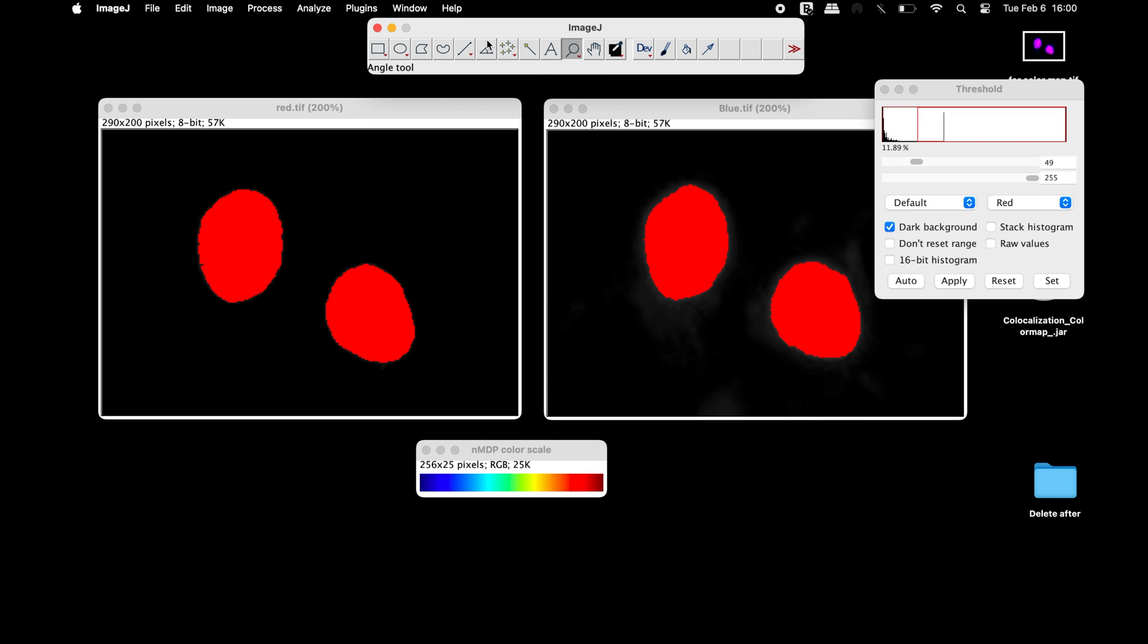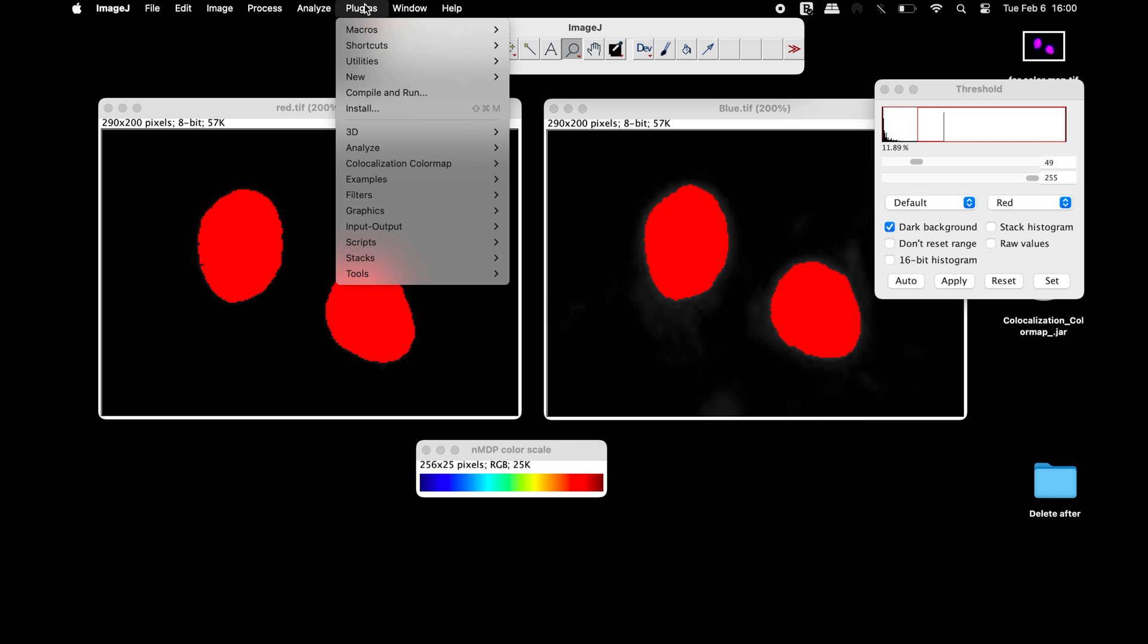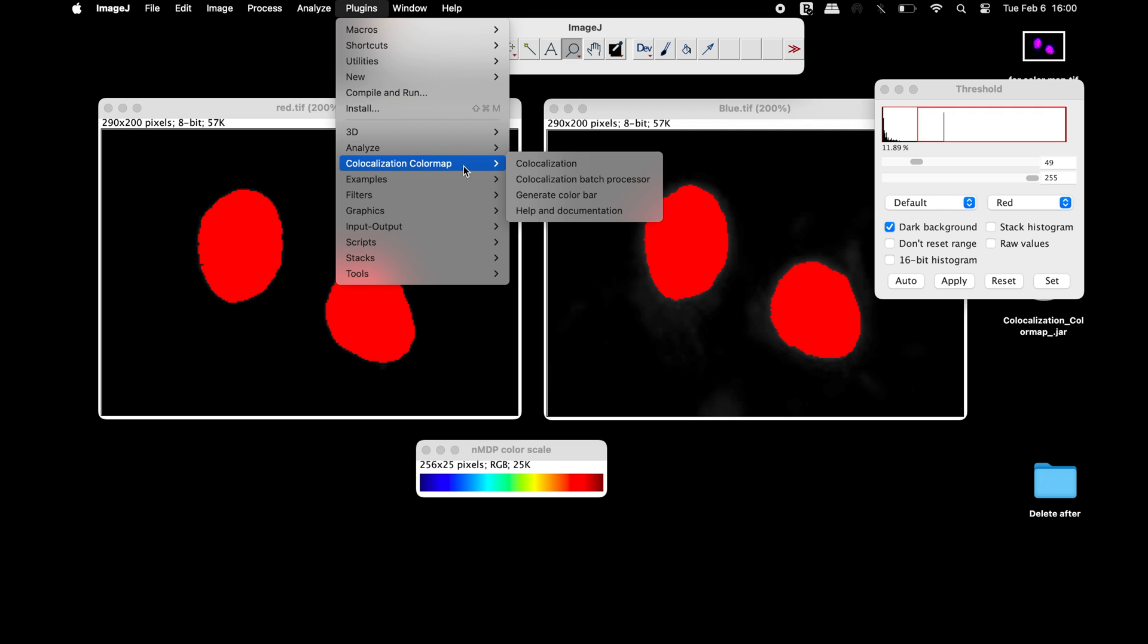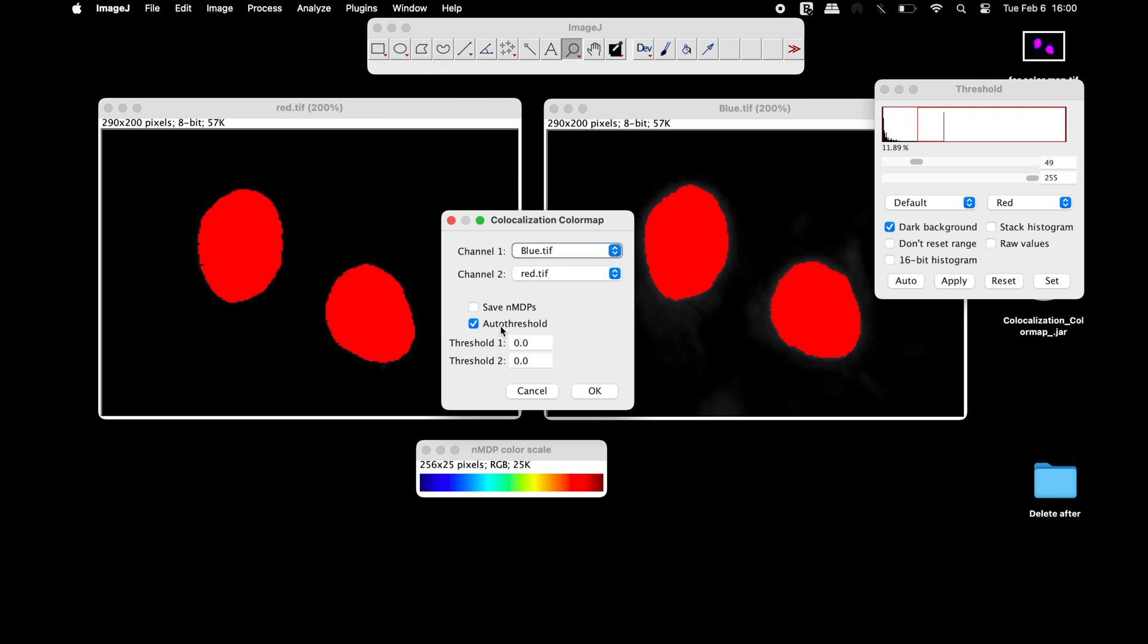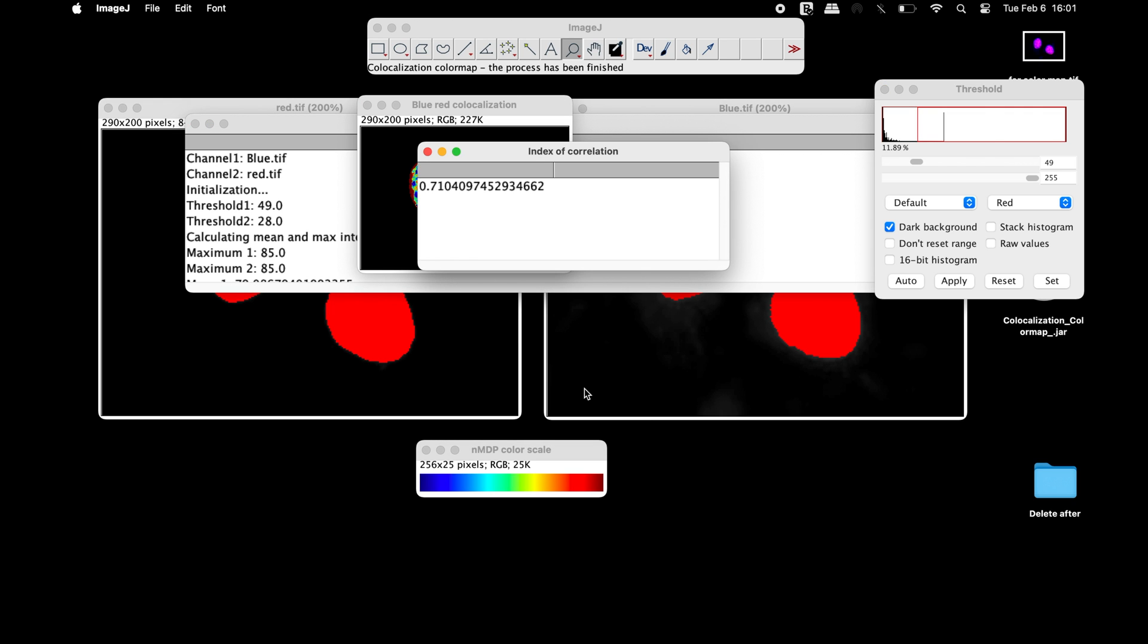Now head to the co-localization color map plugin and select co-localization. Input the respective threshold values and then click OK to generate the index of correlation and the co-localization color map.